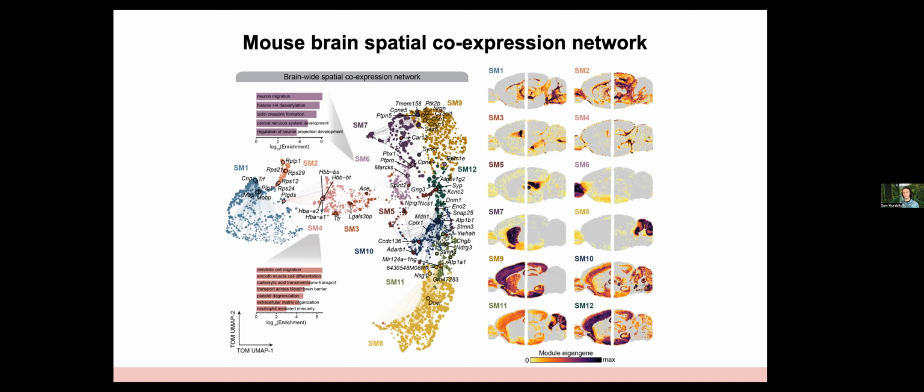But overall for the interpretation, this is definitively telling us where it is expressed. And we can take another step to say who might be expressing this. We can cross-check with single cell data to see, oh, I have these 25 hub genes, which one is expressed by which cell type in this complementary data set. But I think Visium on its own is definitely hard to interpret. Hope that answers your question.